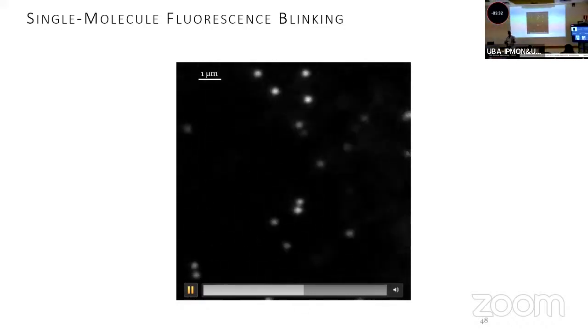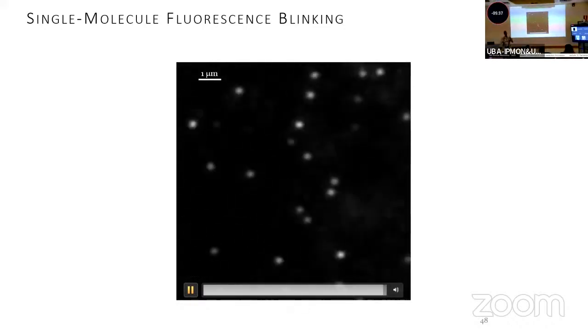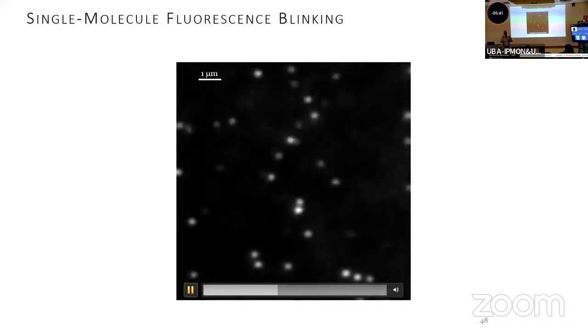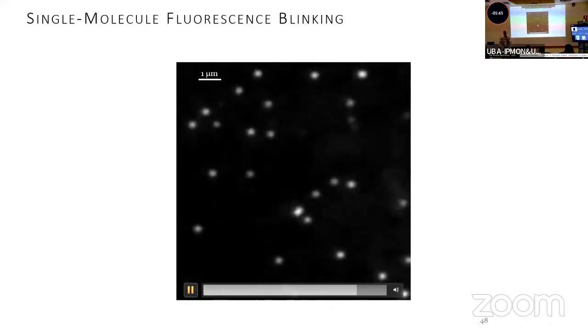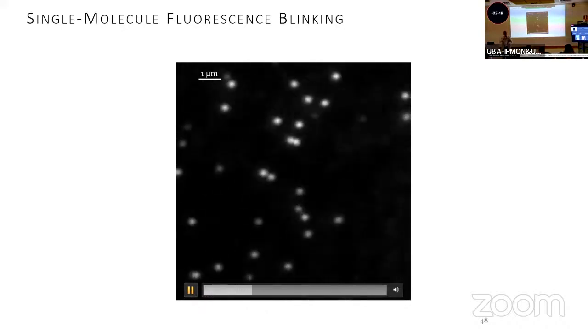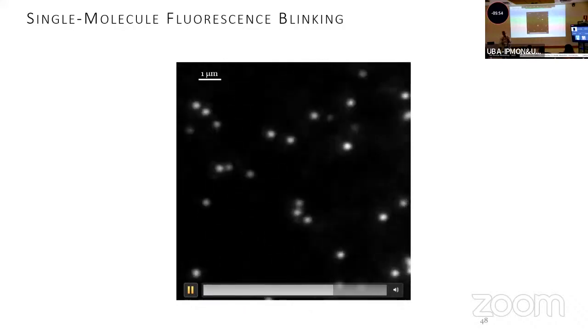And then you apply a lot of filters in your fit. For example, one of the filters could be that it should be round. If it doesn't meet some criteria of symmetry, you could say maybe there were 2 molecules. I don't want that. Another criteria could be brightness, because they should be all equally bright. So if something is too bright, you discard it, because it's maybe 2 or more molecules.